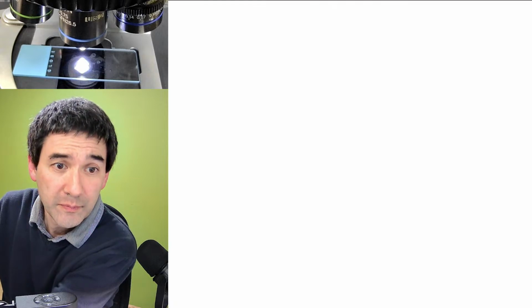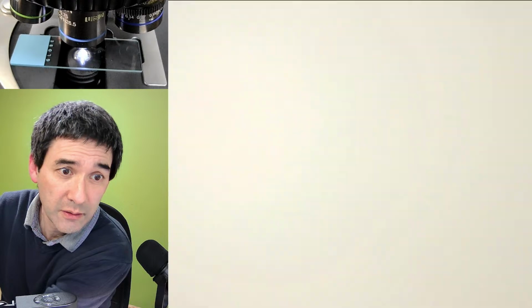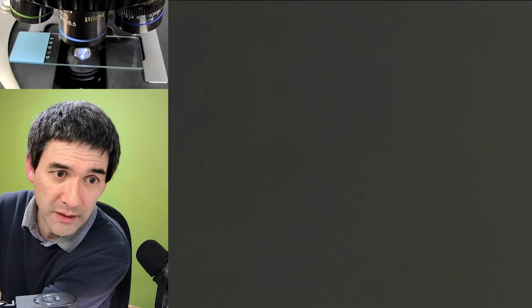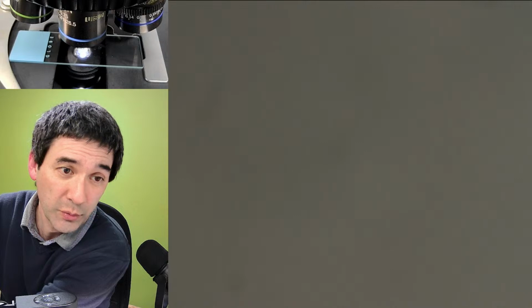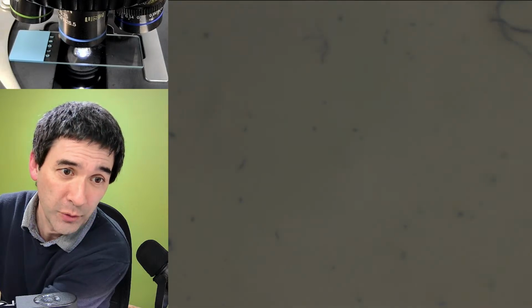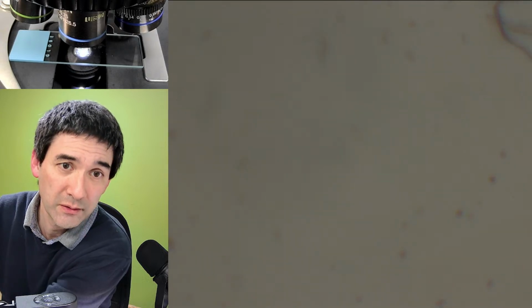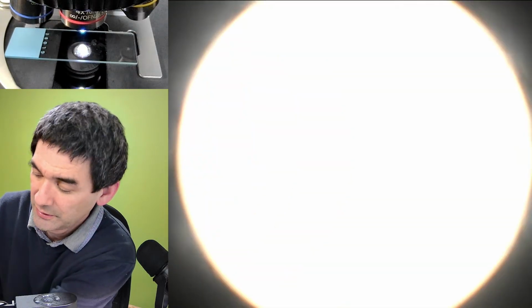I'm going to now... This is now a little bit of a guesswork. Here, are we able to see something here? You should never do it like the way that I'm doing it here. You always start with the lowest magnification and then work yourself upwards. But yeah, see, that's not even the correct one here. So back to the lowest magnification.